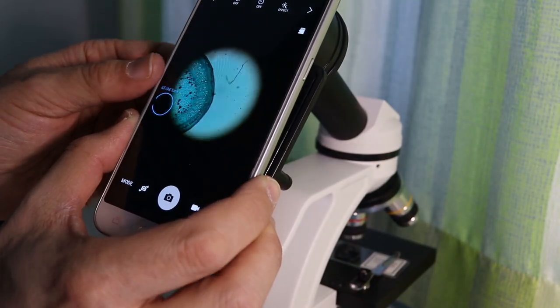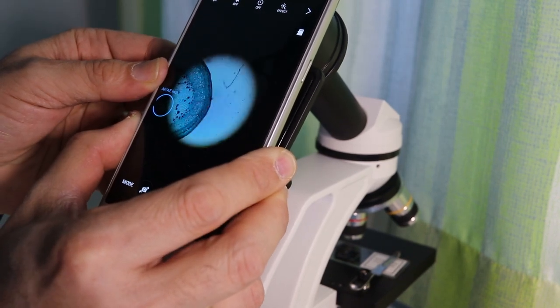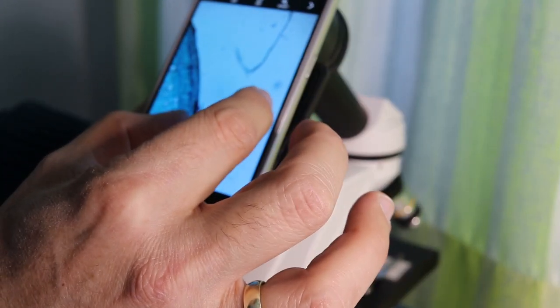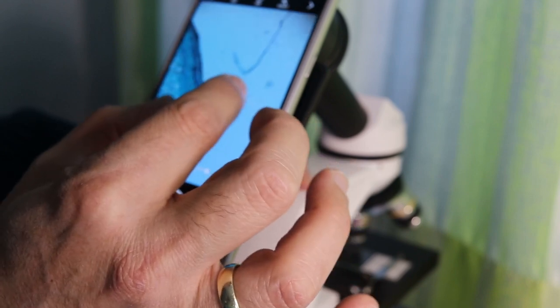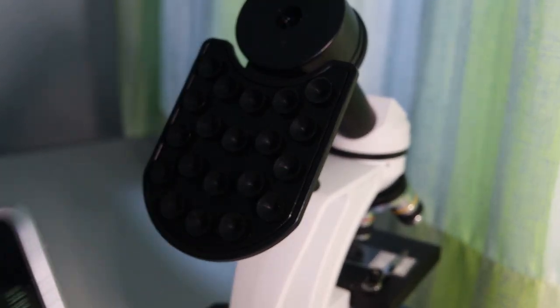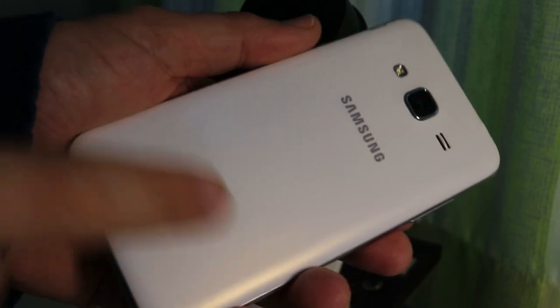I'm now trying to connect my mobile phone here, and you can see a small ring of light, a small disc of light. So it does not fill the full screen. I have to zoom in manually. Of course, unfortunately, I cannot move the picture. So that is the thing. However, it fell off because my mobile phone cover is not smooth. So what you have to do is use rubber bands to fix this.